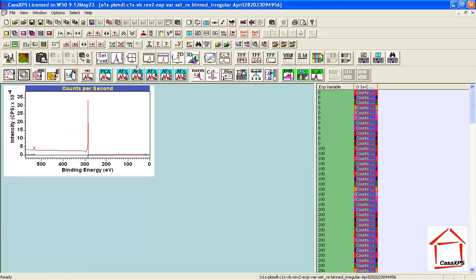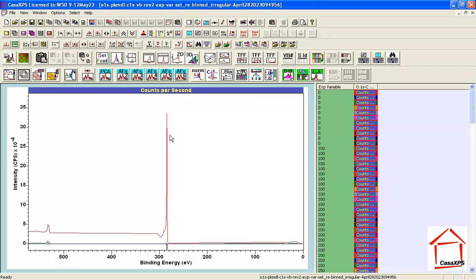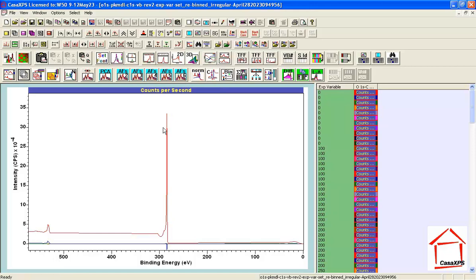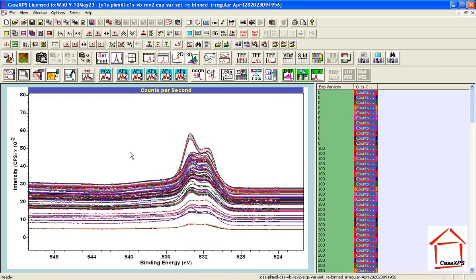That suggests five shapes are within the oxygen, carbon, and valence band combined. Returning to single tile display, this tells me I should use five abstract factors to reproduce the data — getting better signal and less noise for the spectra I'm about to use for subtractions and multiplications. There are buttons for quickly calculating reproduced data based on two, three, four, five, or six abstract factors. Pressing the five abstract factors button and zooming in confirms a superior signal-to-noise ratio in the smoothed data.